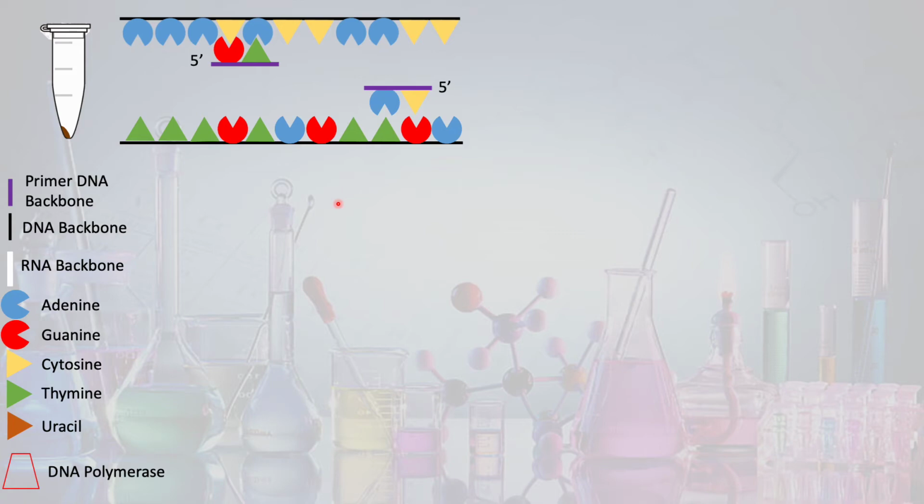So once this reaction process has reached the correct temperature, DNA polymerase will come in, and DNA polymerase is going to generate a new strand of DNA that begins where our forward primer starts and ends where our reverse primer starts. So this is where the product size or the product length that we've previously described comes into play. The product that is generated during this process should match the product that we've previously researched while designing our primers. And when we get to testing these on a gel, I will describe and show you why it's important to know the supposed size of your primers.